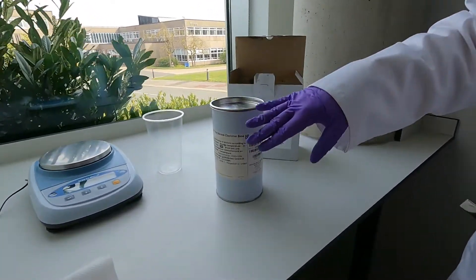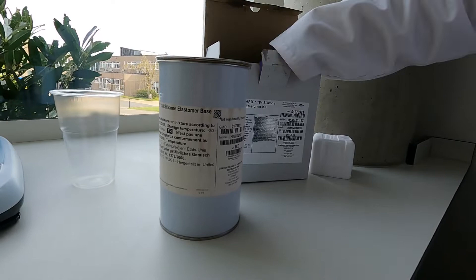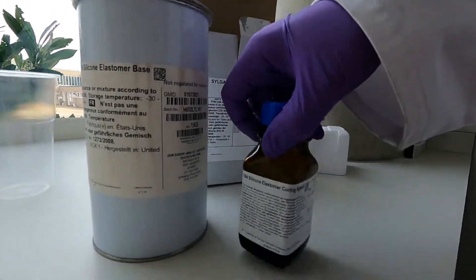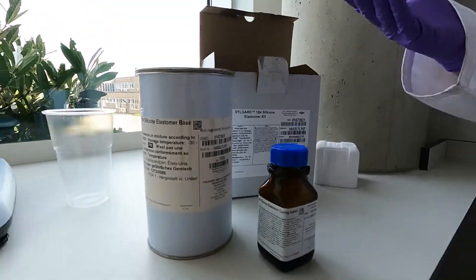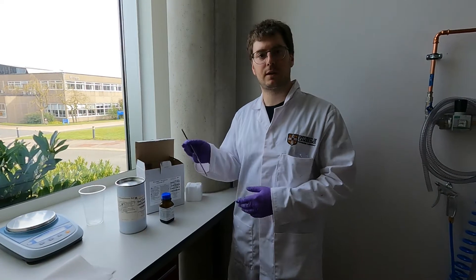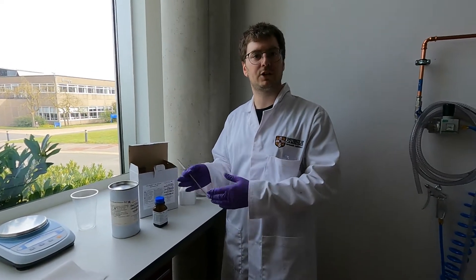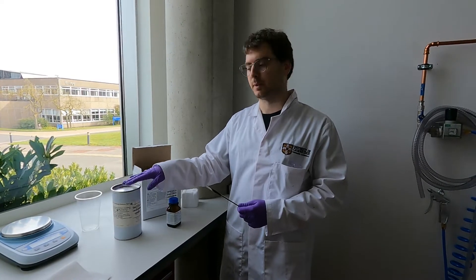There is one can which is the elastomer and then the second component is the curing agent. From the specifications in the datasheet of Dow Corning, which is the manufacturer, we are supposed to mix it in a ratio of one part curing agent to ten parts elastomer.